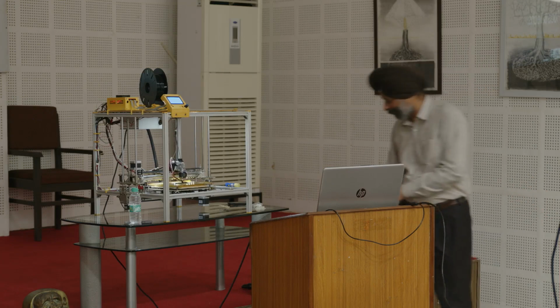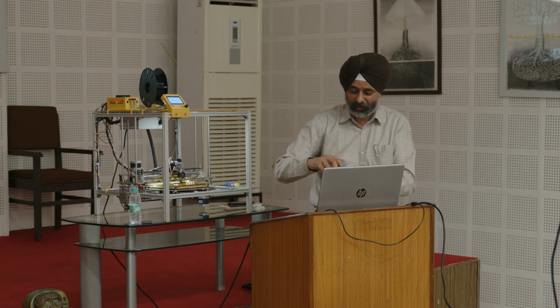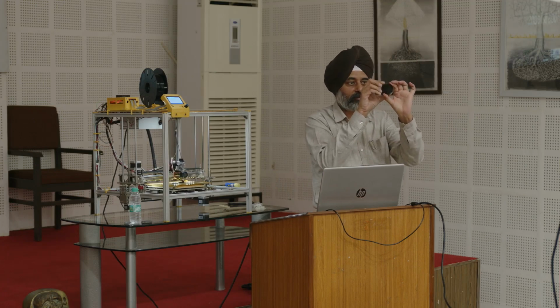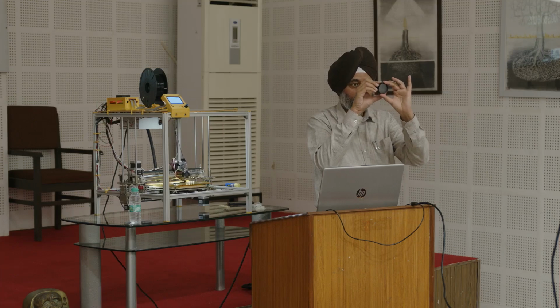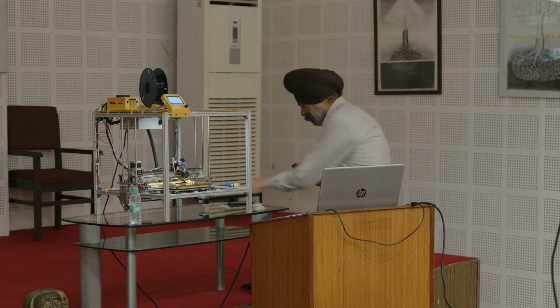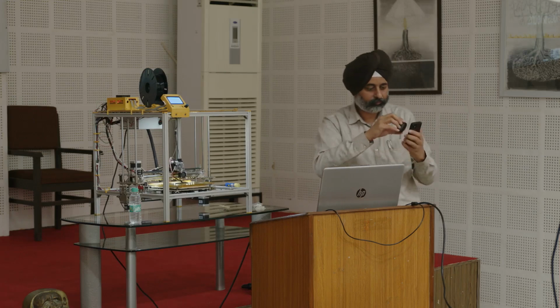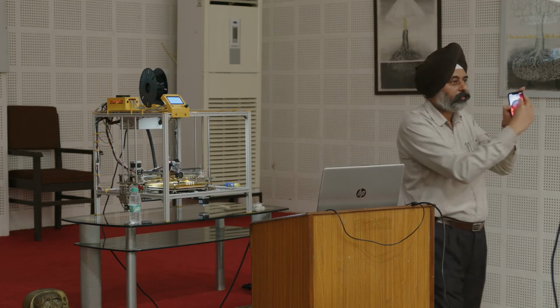So we'll do a small experiment here. I have got two linear polarizers with me, which are difficult to get these days. What I'll do is place it before my mobile. Can you see the mobile screen through this?